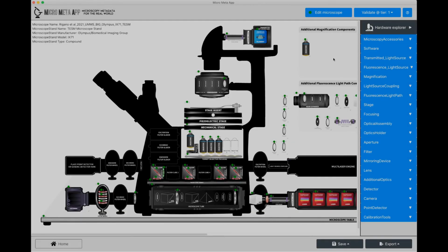Once we have inspected this file, if we think it is going to be useful to us and we want to save it in our home folder, we can save it by clicking here. And when we do this, we have two options. We can save it as it is, and we will keep the same ID that is already present in this file. Or, if we want to create a clone of this Microscope.JSON file to save information about our own instrument, then we should save as new so that we can create a new ID and have a brand new Microscope file to further edit.